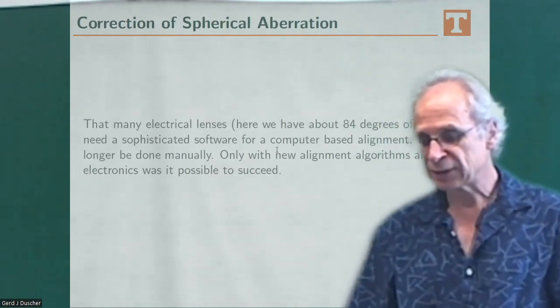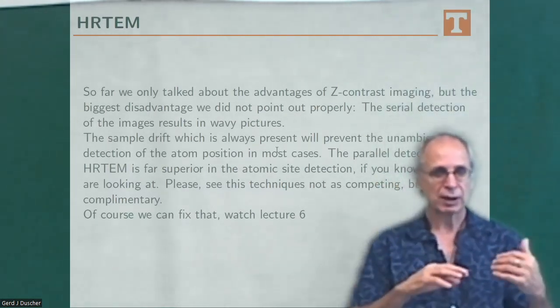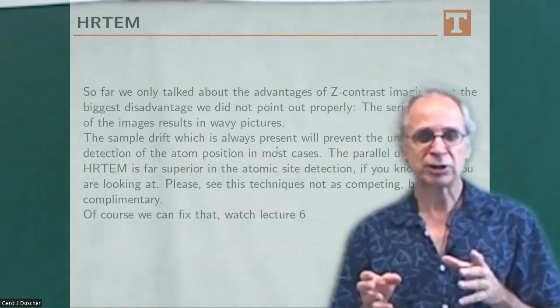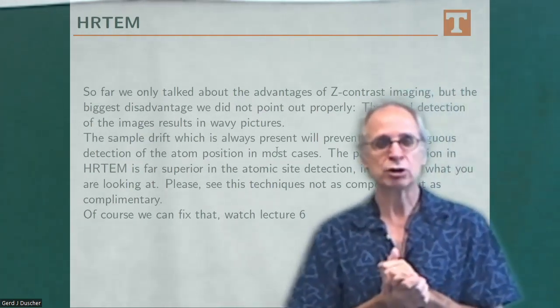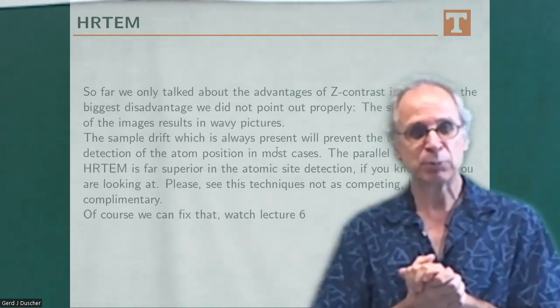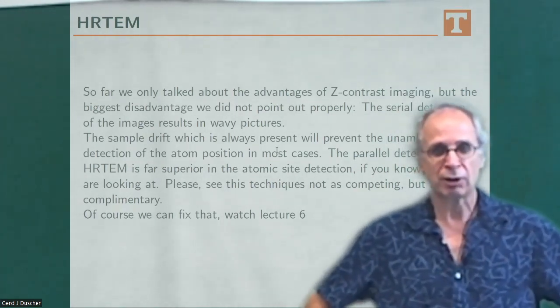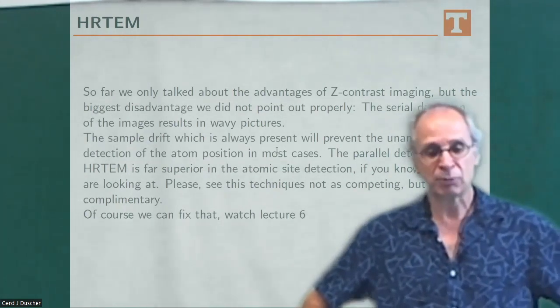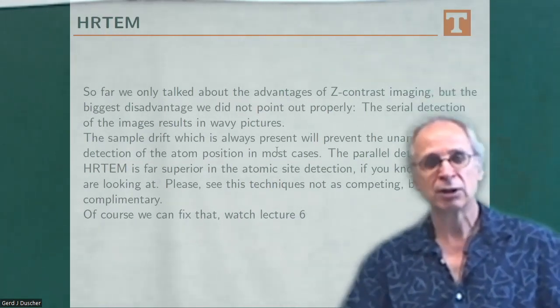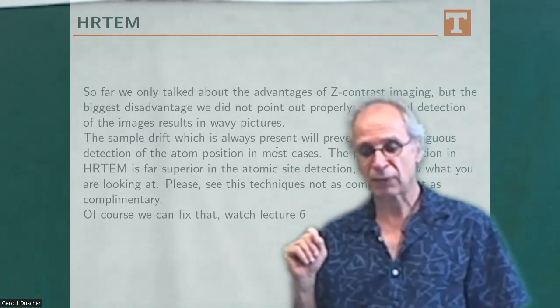So this is what we are trying to do. And again, we are trying to combine different techniques, and phase contrast images are taken in one shot. So any feature is washed out if there's any kind of drift or instabilities, but distortions are very minimal, and the minimal ones can be determined so that you know exactly where the atoms are, what kind of atoms there are, we can determine in STEM.